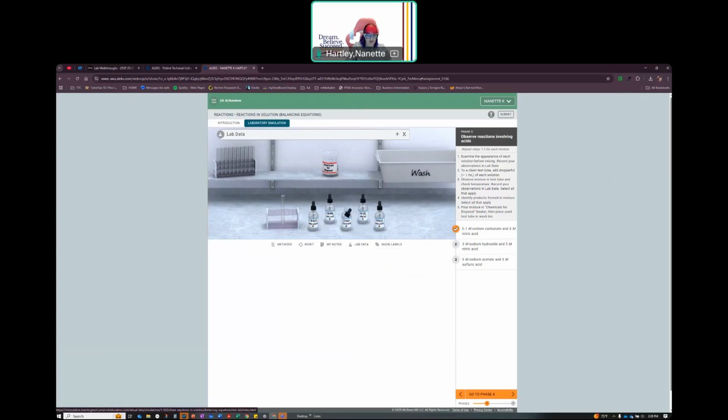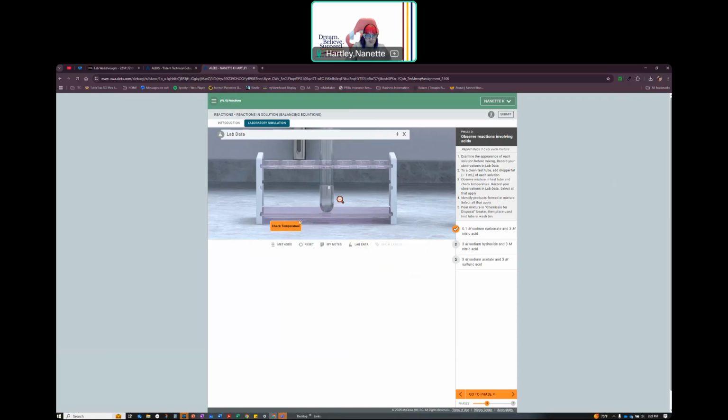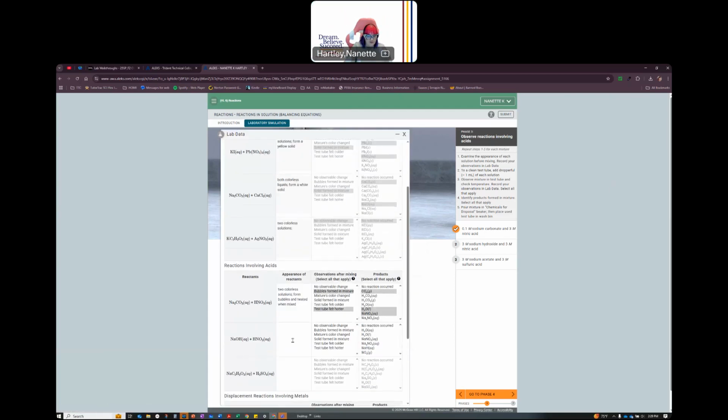Well, that's this guy. He's a colorless liquid again. Put that back in there. I'm going to mix that with the nitric acid, which is this guy right here. Both colorless liquids. Tube feels heated. Two colorless liquids.